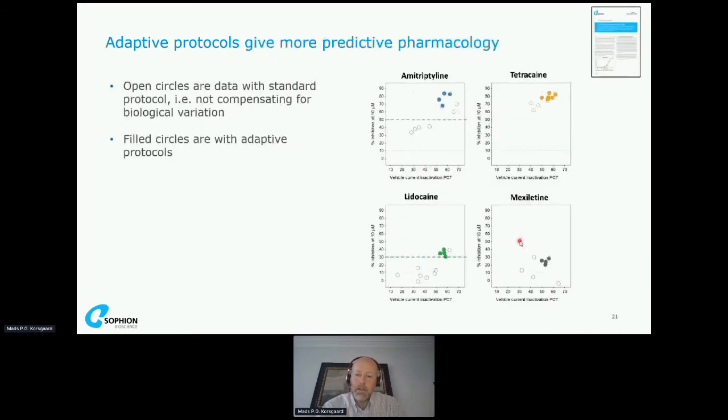Applying that to a pharmacological experiment, in this case looking for state-dependent sodium channel blockers, you can see here the difference. These are data nicely done by Charles River. You can see how running a protocol where you just use the potential that you read from the literature, versus letting the instrument inquire the cell itself what it takes to bring you to the state where I'm looking for the effect of my compound.